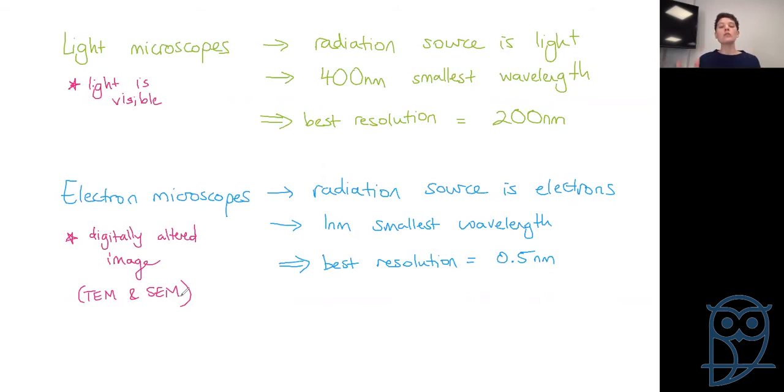So it looks much more like a traditional microscope slide. And an SEM, you're actually looking at the surface of something. So you can get the really amazing details of that surface in like a 3D representation of the surface that you're looking at. So different images, different values, different points of use, depending on what you're studying, what you're looking at, that will then affect which method would be the best.